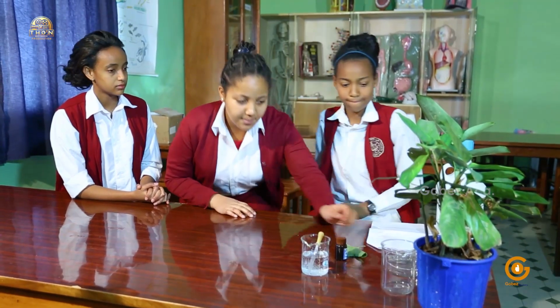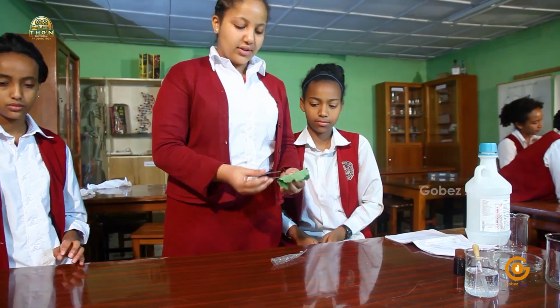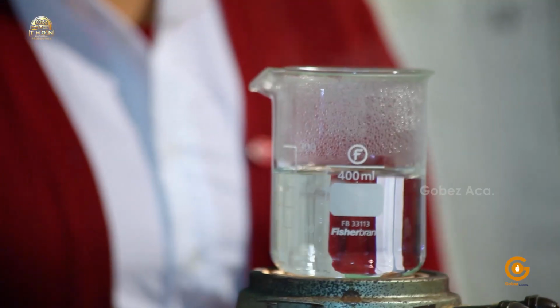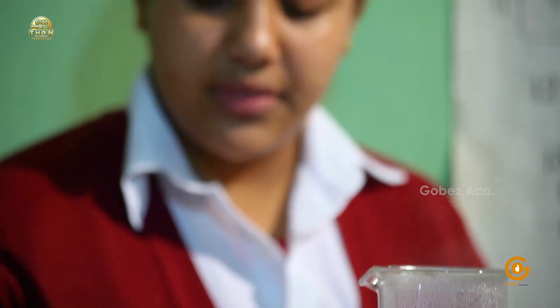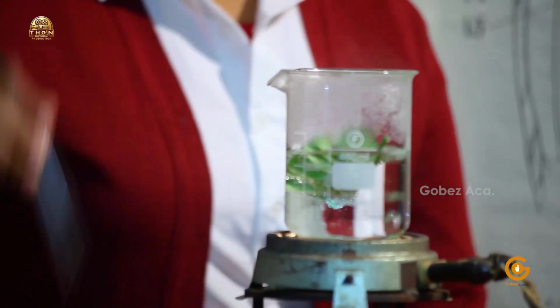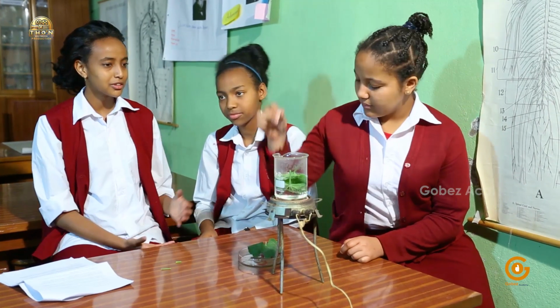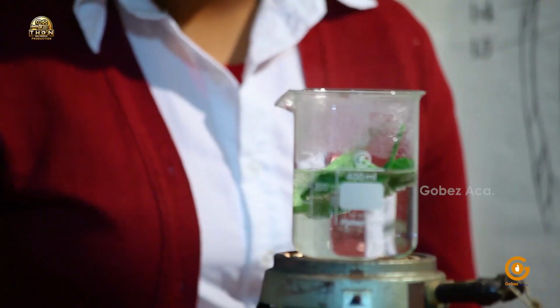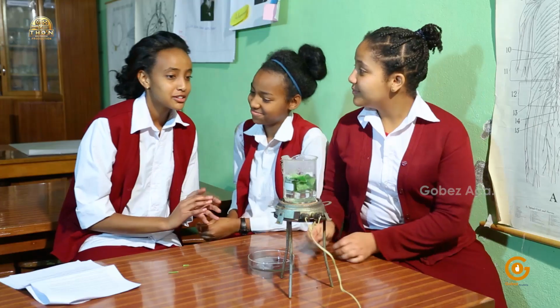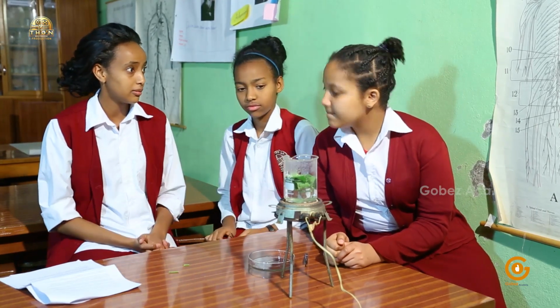Now, using forceps, we put the fresh cut leaf from outside into the boiling water for about 30 seconds. But do you know why we boil the leaf? Of course, it's to remove the waxy cuticle on the surface of the leaf. That's correct. And also, it kills the plant cells and breaks them open and helps them to react with iodine.